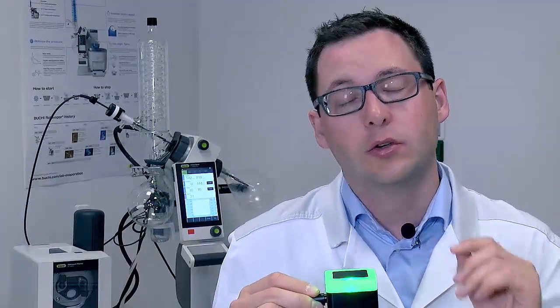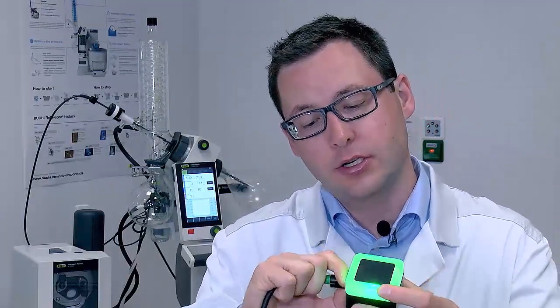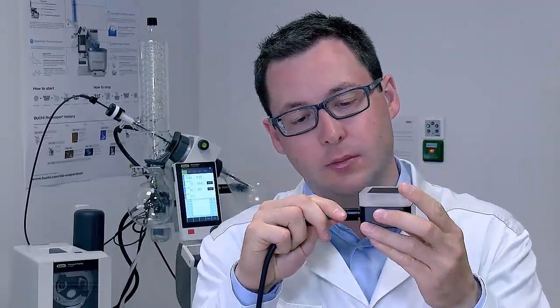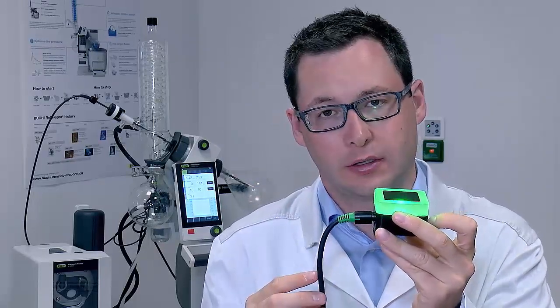Attaching this device couldn't be simpler. It's actually just two ports with the Bücher cable. You plug it in, it will do some self-testing and turn green when it's connected.